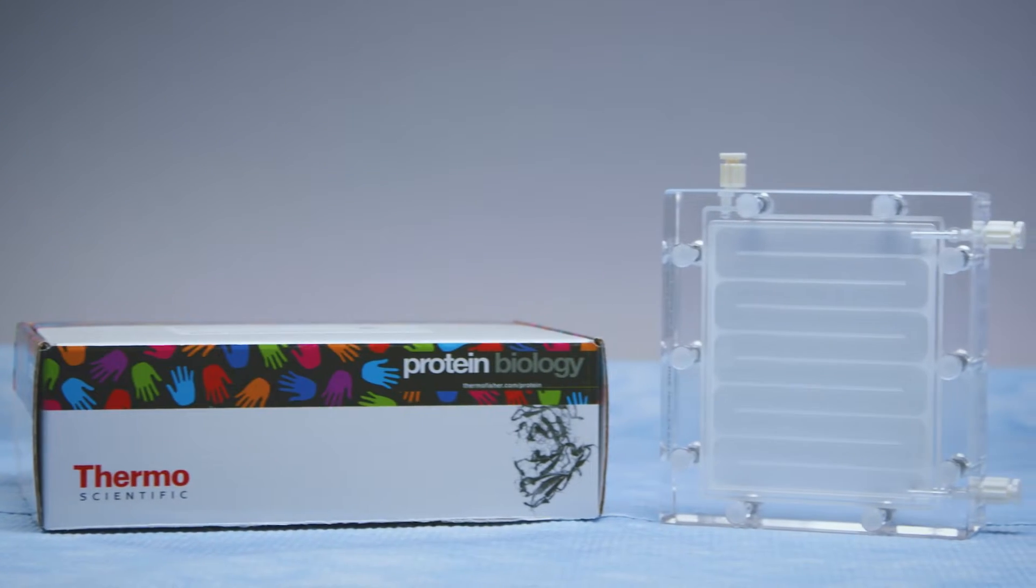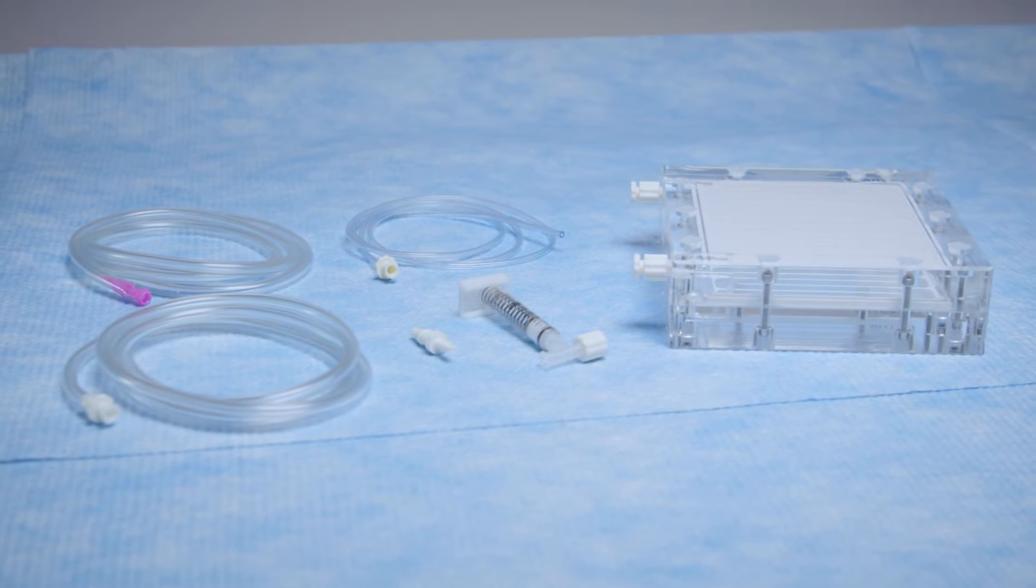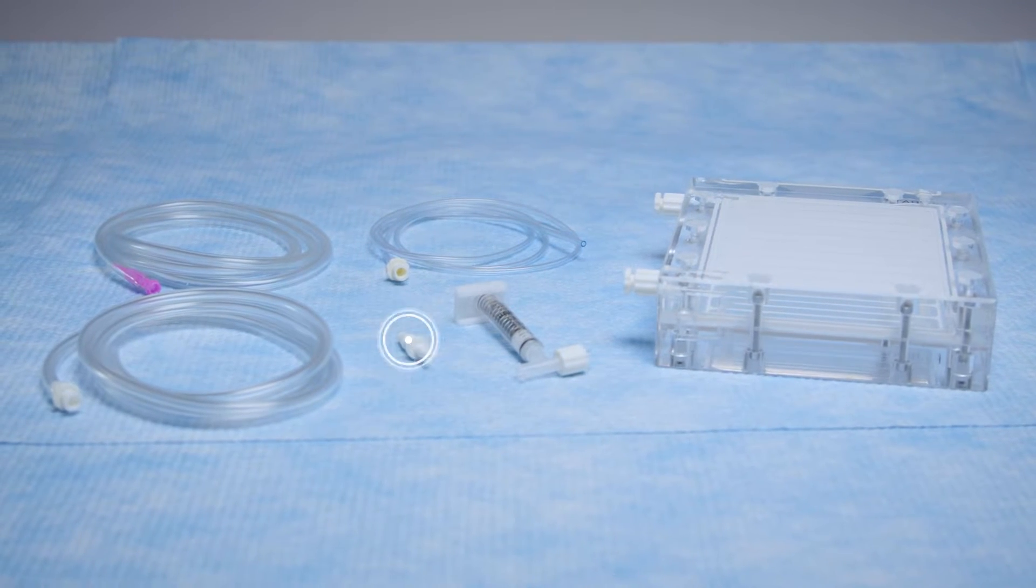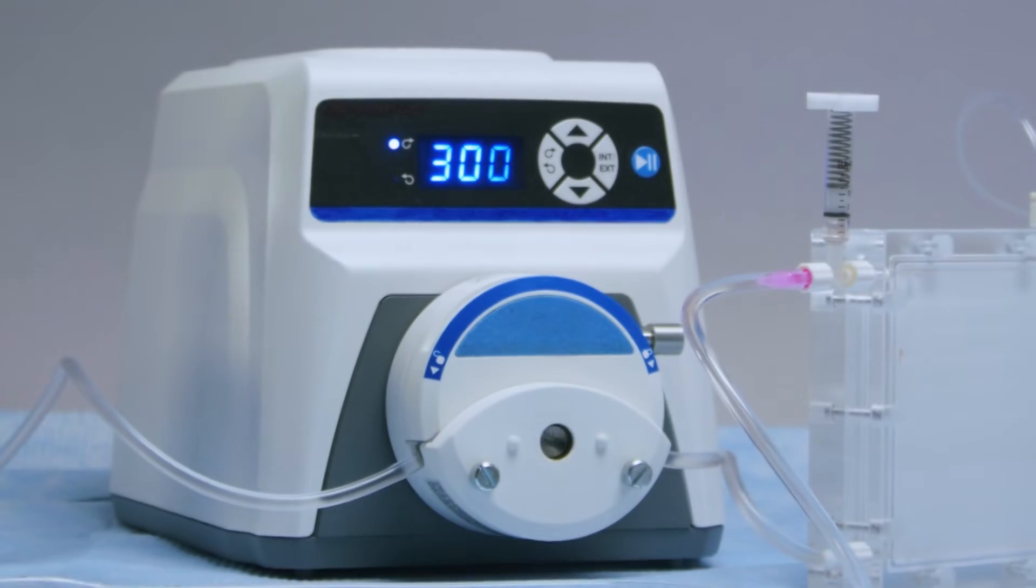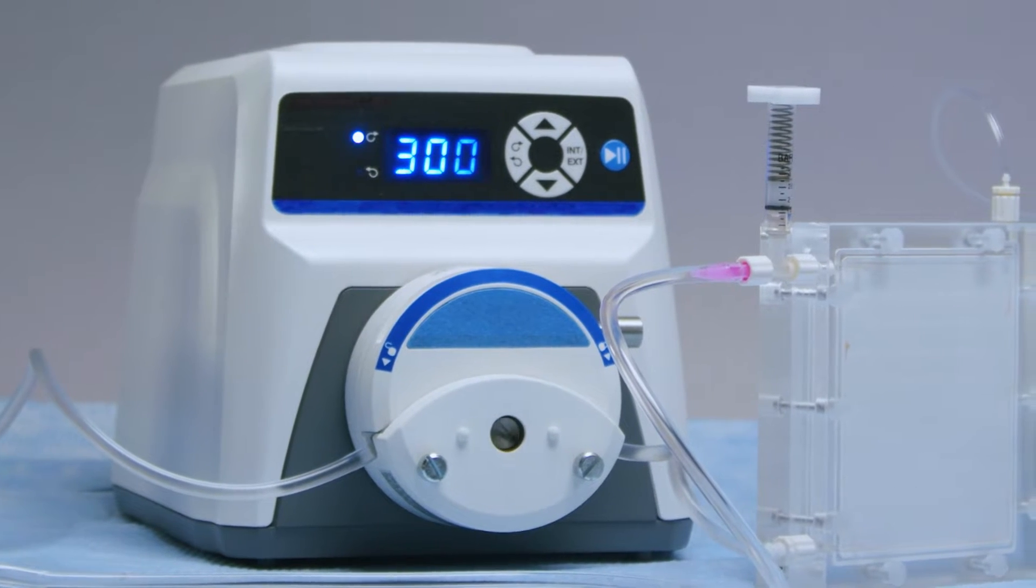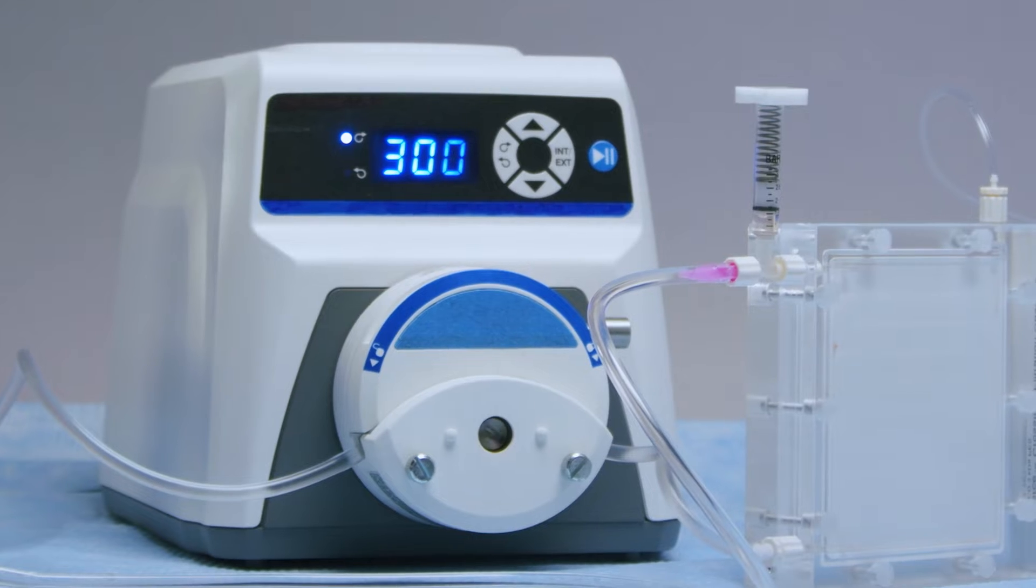The accessories supplied with each cassette include required tubing, a pressure indicator, and a tubing reducer. A peristaltic pump with a size 16 pump head and reservoirs for sample and filtrate are required and are not supplied.